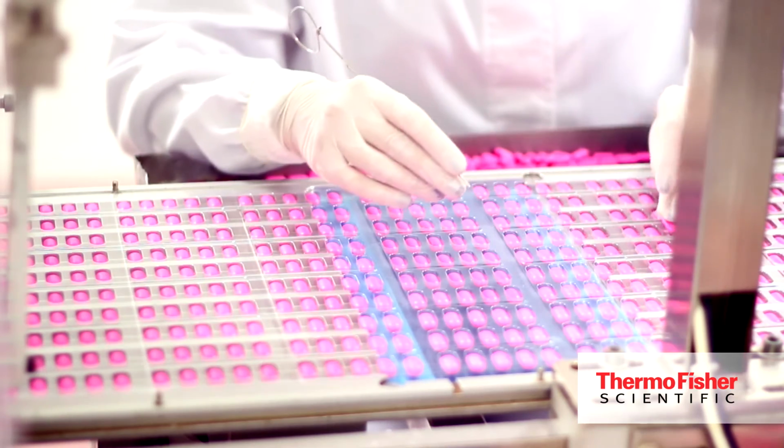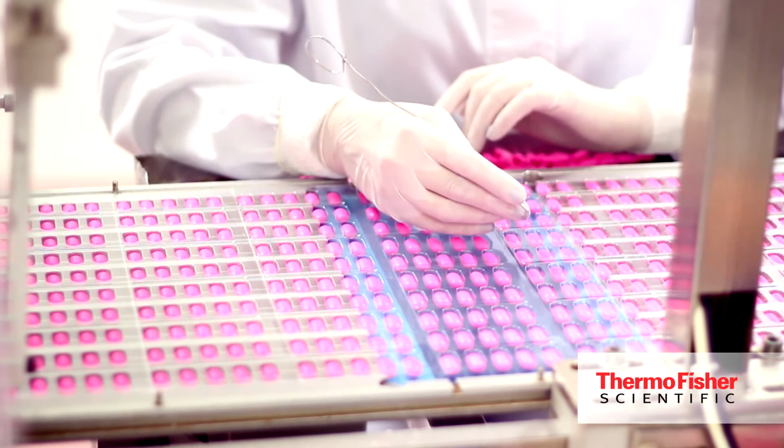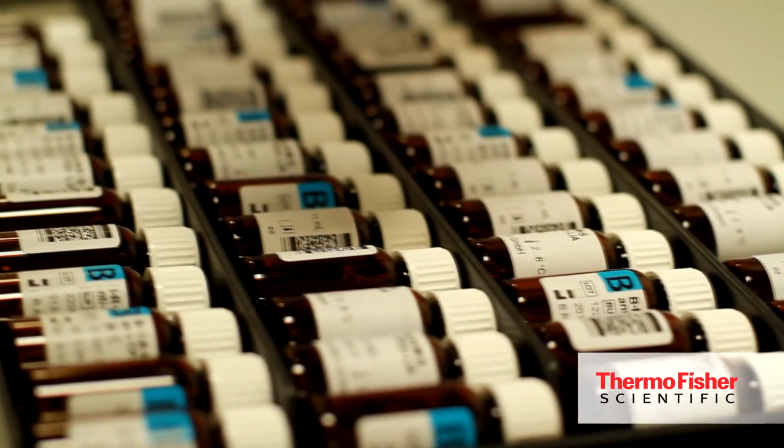So in principle, the background of the introduction of these new chapters by the United States Pharmacopeia is that there's an older chapter, Chapter 231, which was implemented roughly 100 years ago, and studies have proven that it's not fit for purpose because it's a very old test based on wet chemistry, and the results don't really match what is actually in your sample.